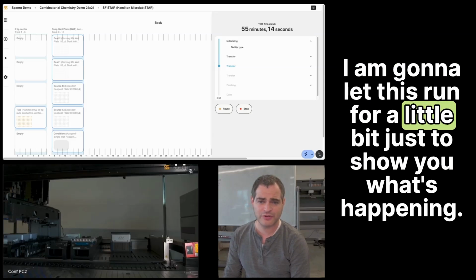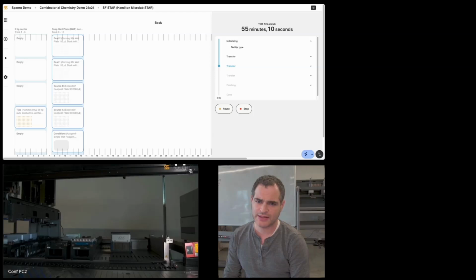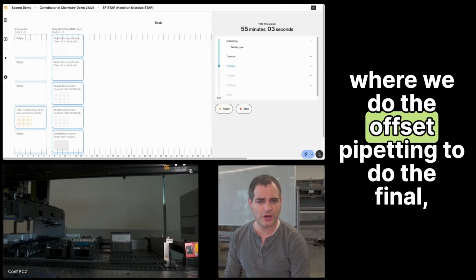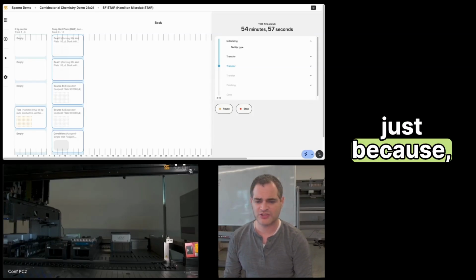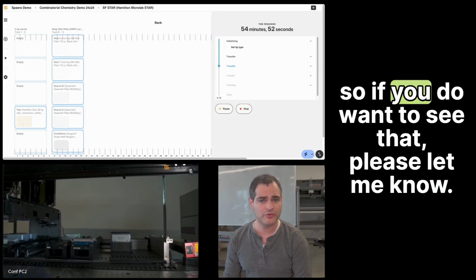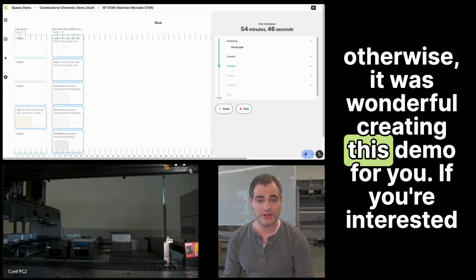I'm going to let this run for a little bit just to show you what's happening. We may not get to the stamping part where we do the offset pipetting to do the final correspondence in this particular video, just because it's going to be quite a bit of time between now and when that happens. So if you do want to see that, please let me know. Otherwise, it was wonderful creating this demo for you.